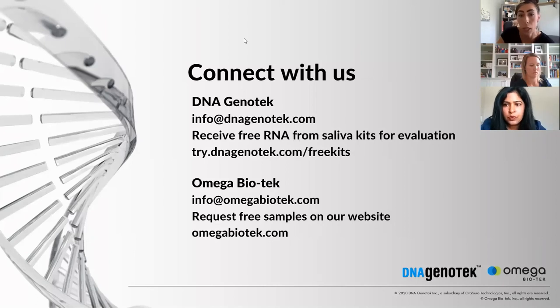And then the next one, again for you, Kiran, is how fast is the Xpress kit? As I mentioned in the webinar earlier, on a Kingfisher platform, one can extract 96 samples in about 40 minutes. I've also mentioned timings for different platforms, like the Hamilton Star, where you could do 384 samples in 1 hour, 45 minutes. On a platform such as the Tecan Fluent 1080, the same 384 samples can be extracted in just 75 minutes. So it depends on the liquid handling platform and how many samples the end user is extracting.